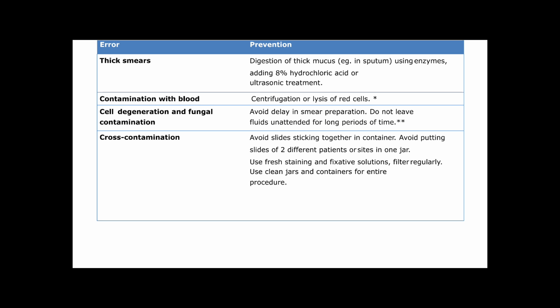cell identification. Red cells are more dense than other cells and therefore settle at the bottom of the tube, with a buffy coat containing white blood cells, etc. above the red cell layer, which separates it from the other cells; that means the diagnostic material is on top.